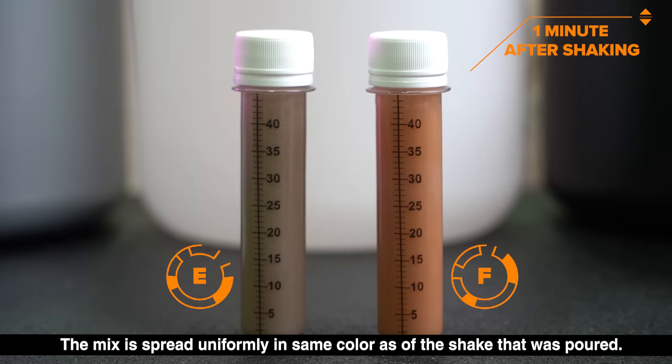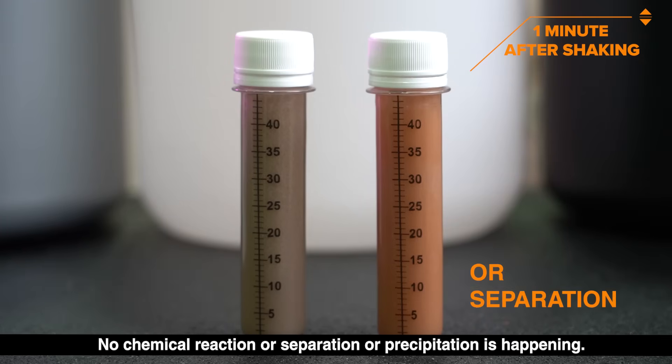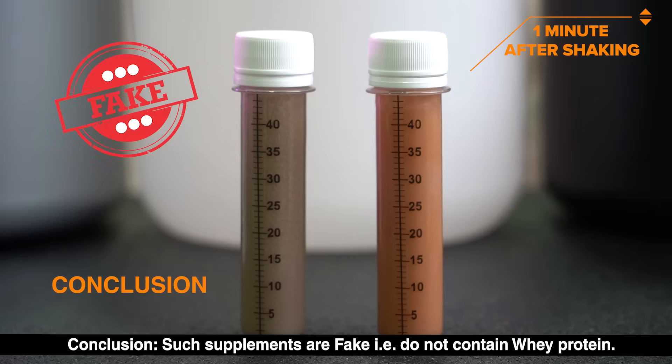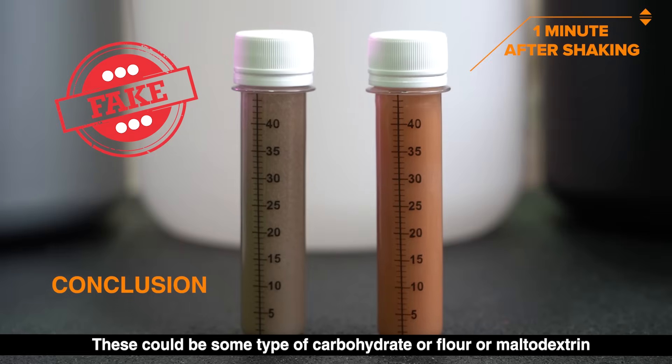One minute after shaking, in test tubes E and F, the mix is spread uniformly with the same color as the shake that was poured. No chemical reaction, separation, or precipitation is happening. Conclusion: such supplements are most likely fake — that is, they do not contain whey protein. These could be some type of carbohydrate, flour, or maltodextrin.